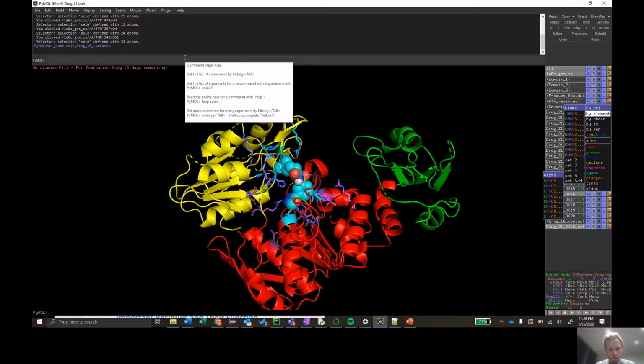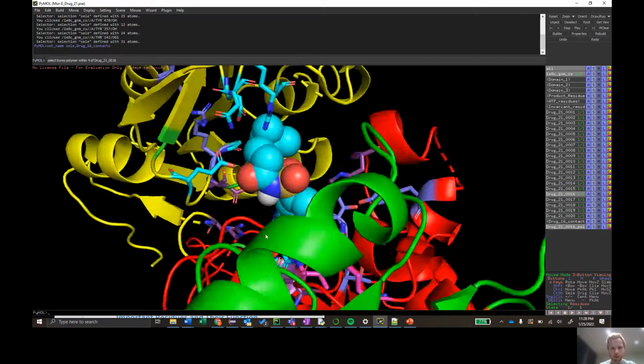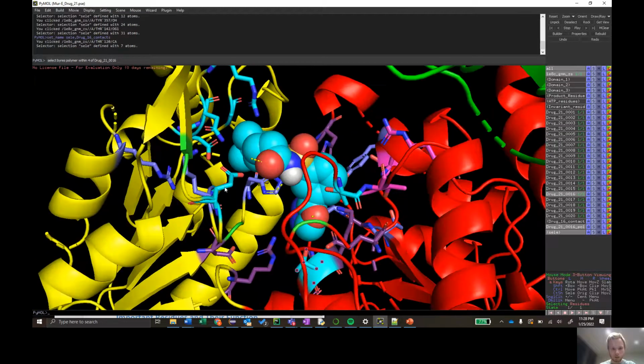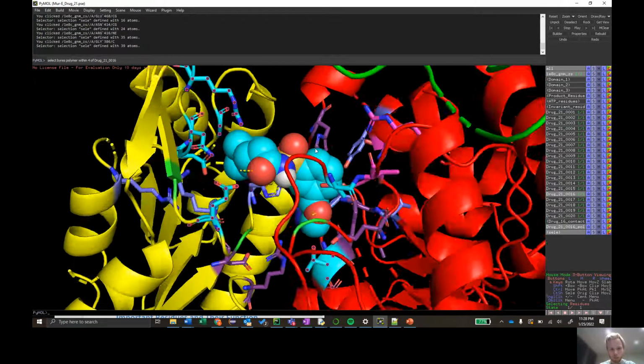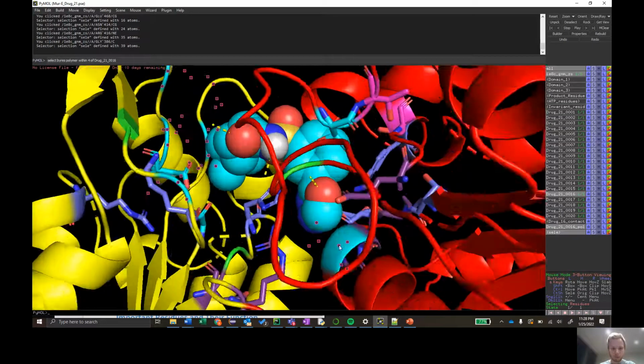And there are additional sets of colors for the by element that have different coloring options. And then if you want to select all those ones, and if you have any extras left over, you can just do that, and then you can hide the sticks. Oh, missed one.